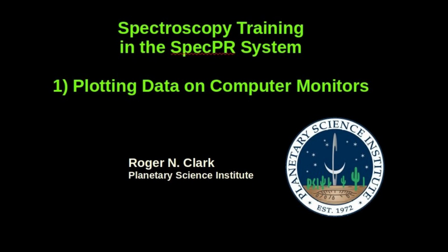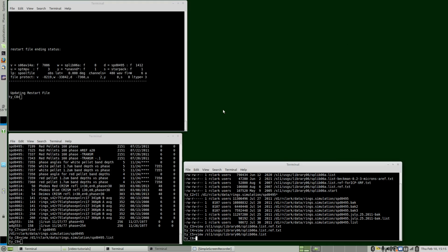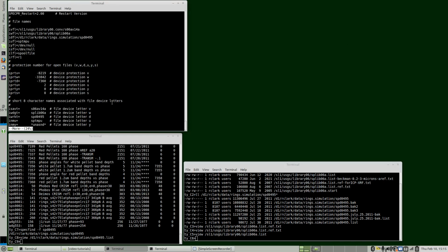In this video, I'll demonstrate some of the things that can be done plotting data on computer monitors with the Specpr system. I've set up a directory that contains several Specpr files. There's a spectral library here and a working directory with some testing data.